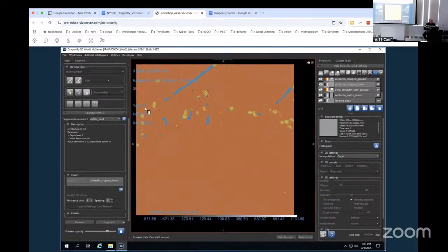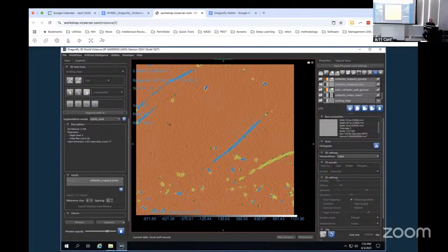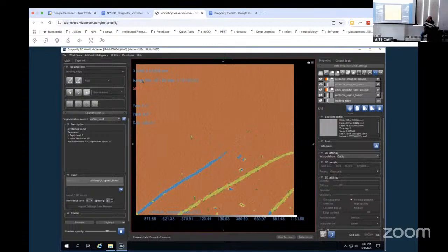Now, this just happens to be a really bad example of trying to do this, because normally, say it was just actin and cofilactin and we weren't actually trying to segment the little cofilin off of it, I could just remove islands and get rid of all of these tiny little pieces in one button press. But when I do that, it's also going to get rid of all of my tiny little cofilin class. And so it's not ideal, but let me try.